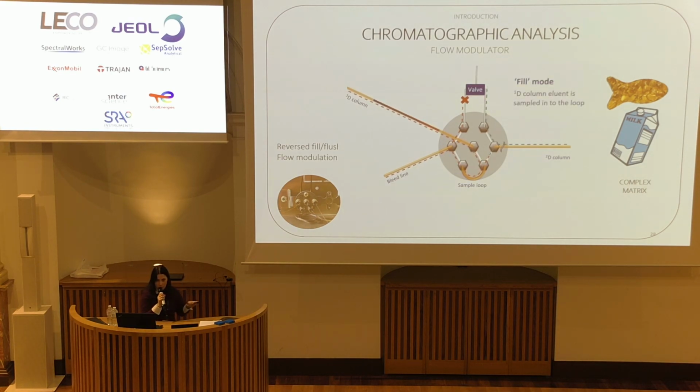Maybe you already know, and in the animation it is shown how it works, but I want to point out the key benefits that we can have with this kind of modulator. First, it's consumable-free, and this also allows us to reduce the running cost compared to the cryogenic modulator, where we need a cryogenic fluid that is not that cheap.